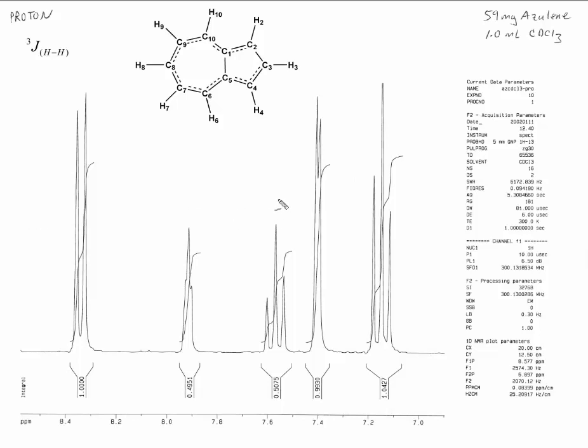In this video, we want to interpret some actual spectra and talk about what is behind all of this splitting that you see in an actual NMR spectrum. We'll also learn how to use 2D spectra to interpret and assign carbon peaks. So here's our example to start off with.